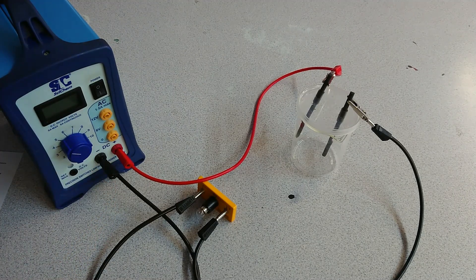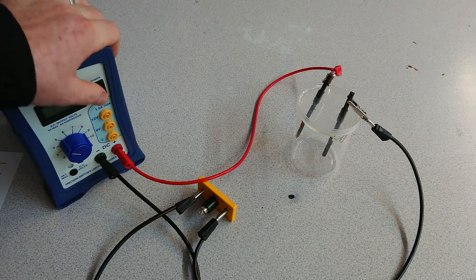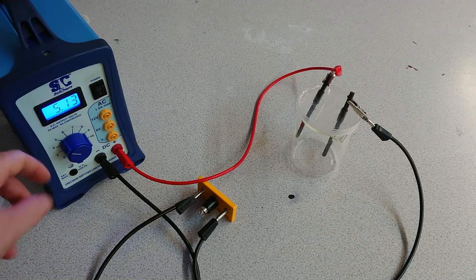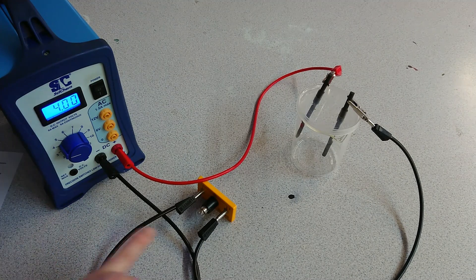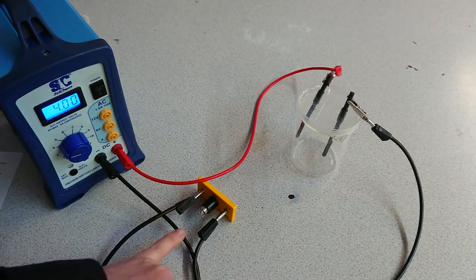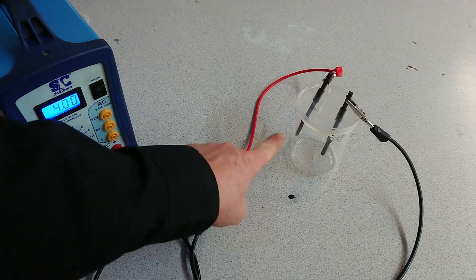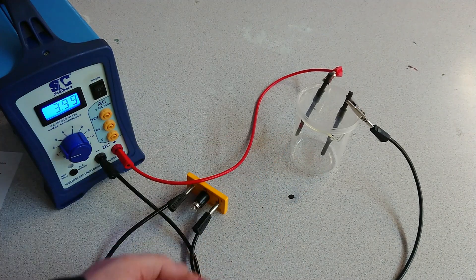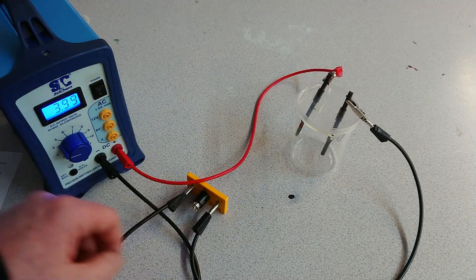We can turn it on. Make sure that we're on four volts, and we can see that we've got nothing happening because we have got no complete circuit. We're now going to add our liquid and see what happens.